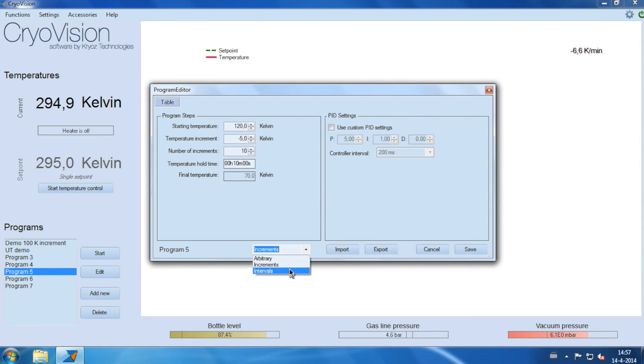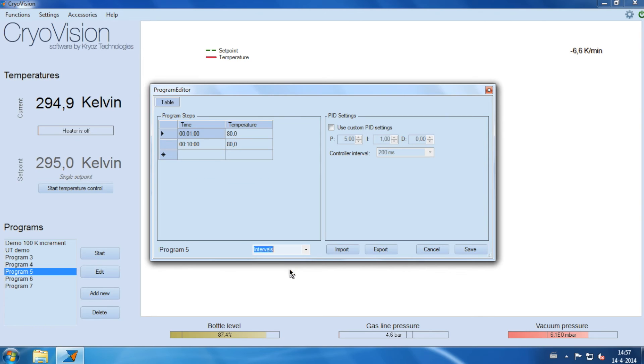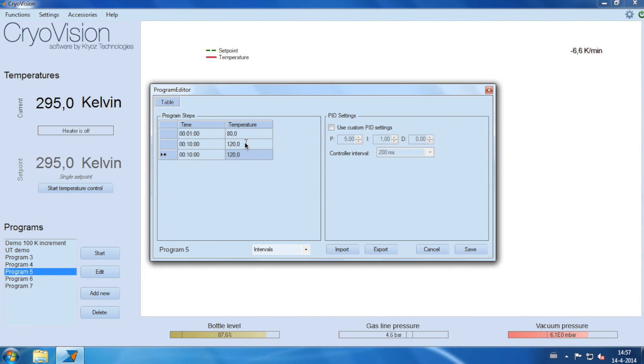With intervals, you simply define the time and temperature in a table format. Additionally, you can define specific PID control settings for your program.